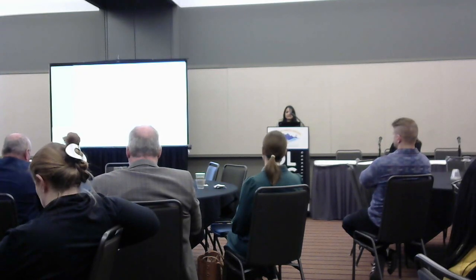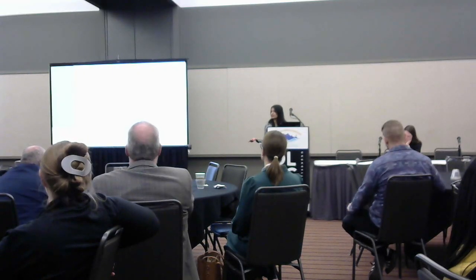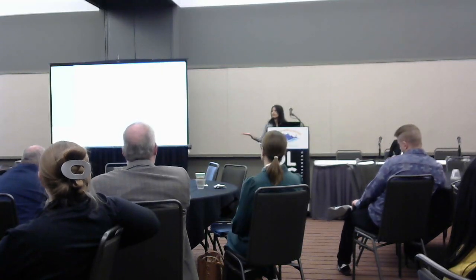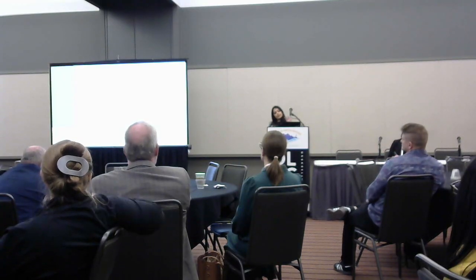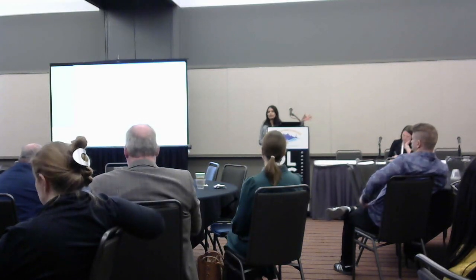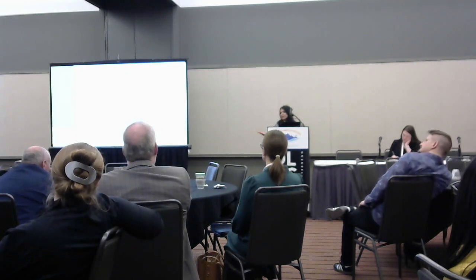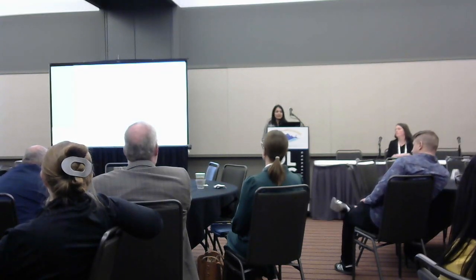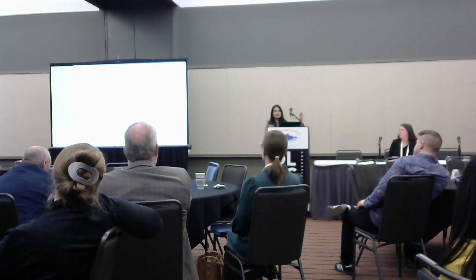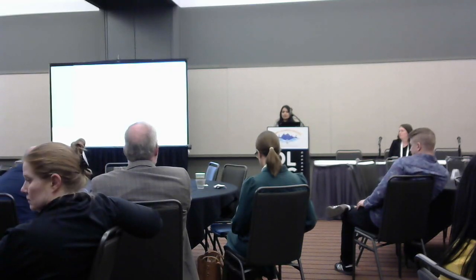At the same time, we also came across this pipeline, which was developed by Allen Institute of Neural Dynamics. They are our neighbors, just across the street, so it was also very easy for us to collaborate with them. And the good thing is they have the exact same microscope that we have. So we thought, okay, that might be easy because they've already customized it for this particular instrument. That might be easy for us to just follow the same thing. But the first roadblock we hit was, for some reason, their input directory is very different from our input directory, even though it's the same instrument. So we had to change a few things there.